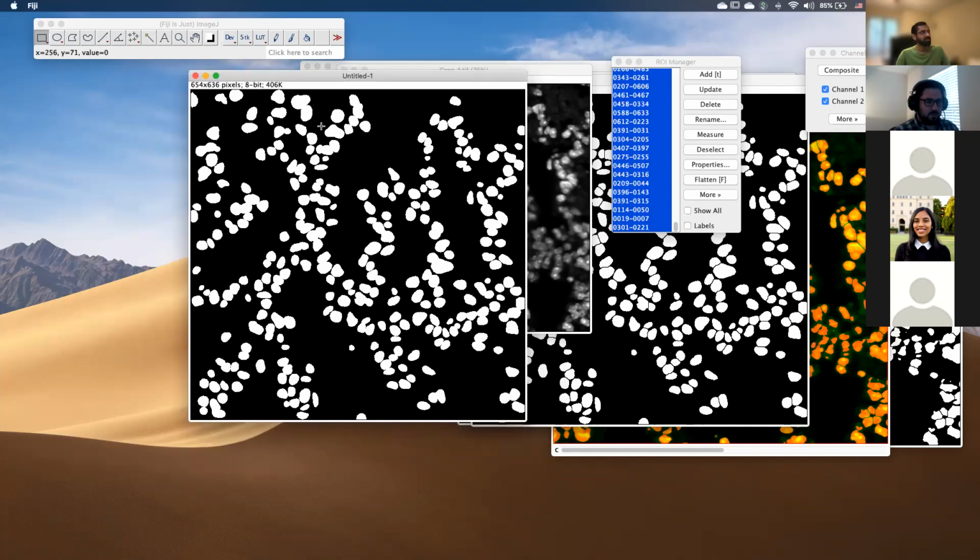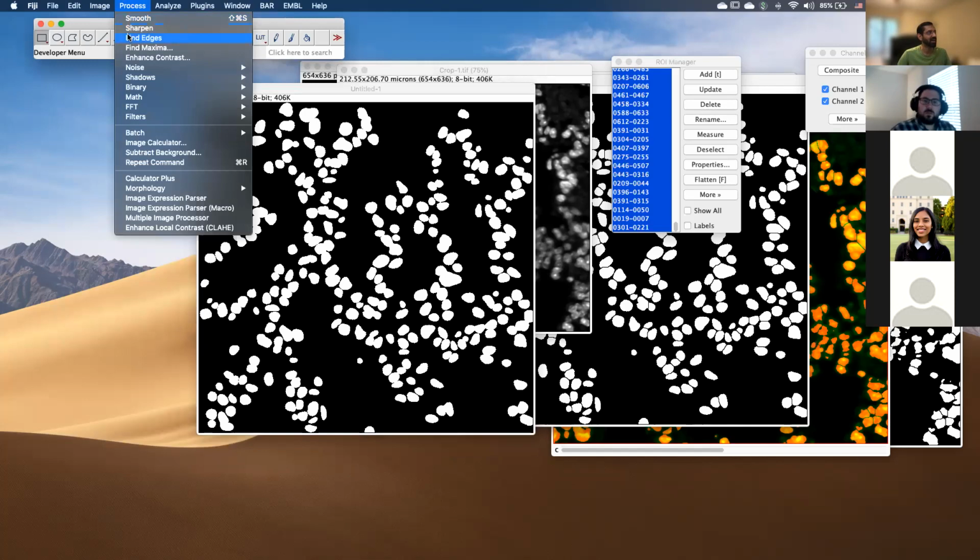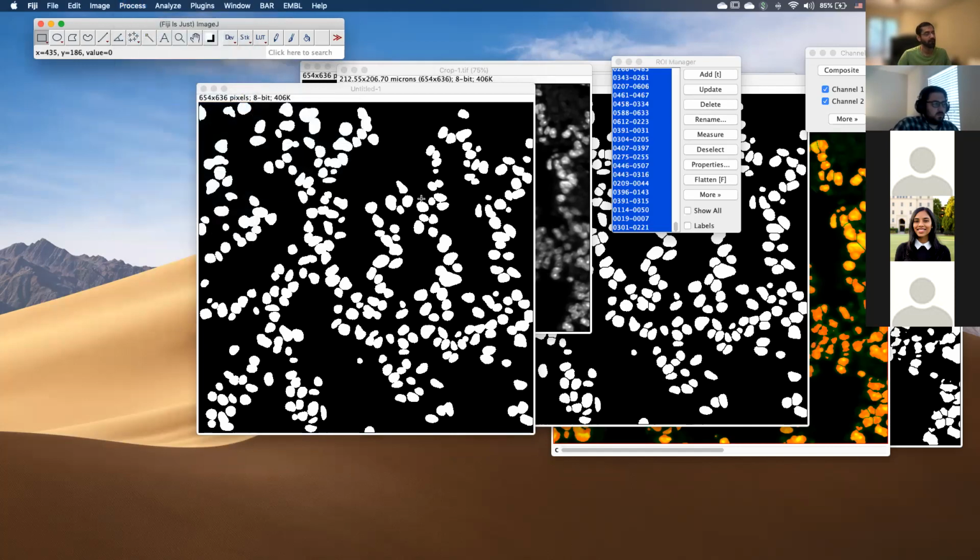So Lucas, where I asked you to invert the lookup table, what if you do not invert the lookup table, and on that, you go ahead and try to do a watershed function? Can you give that a shot and see what happens? I am doing that now. Okay.